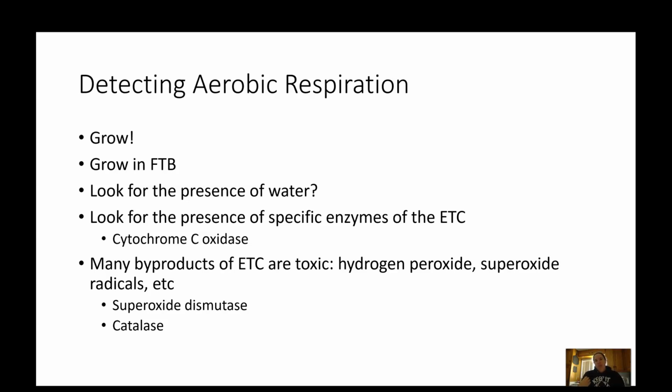We could also get a little bit more specific and grow the bacteria in fluid thioglycolate broth, and look for growth at the top of the tube. Remember, that's where the oxygen is present. But both of these are very qualitative ways, and it doesn't give us a lot of good information about the bacteria.